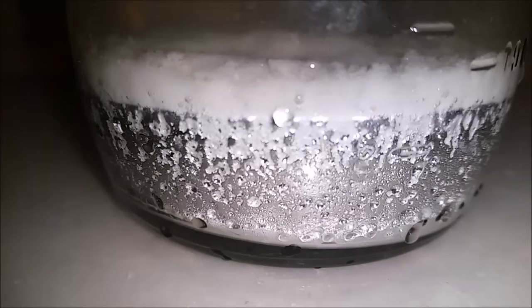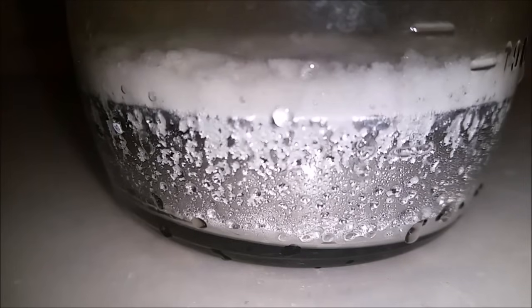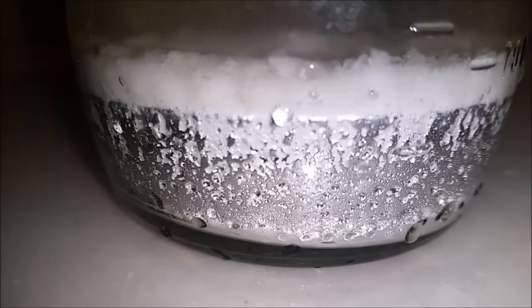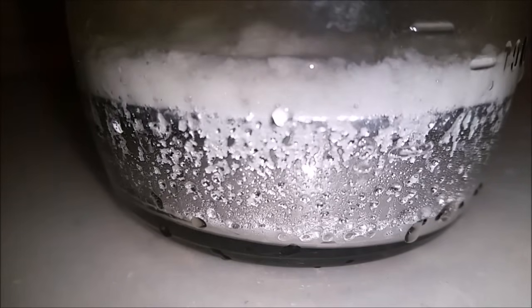As you can see I'm already producing gas at the carbon rod which contains oxygen and chlorine, and the mercury is beginning to bubble as well. This is producing hydrogen and sodium which is being dissolved into the mercury. There's a little bit too much salt here but that should dissolve once it reaches a higher temperature.